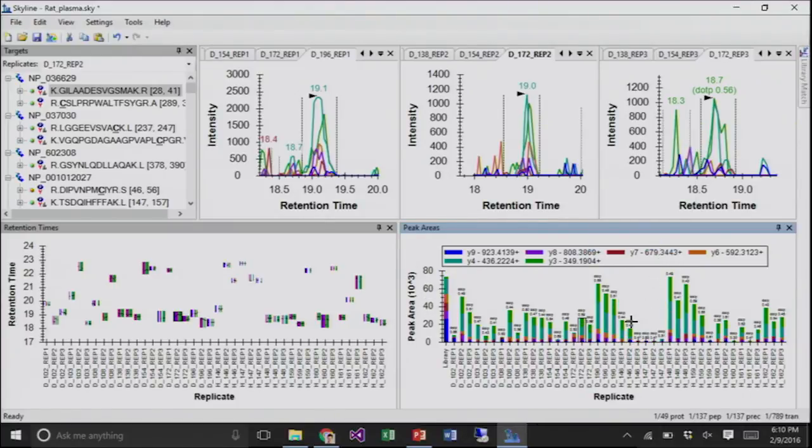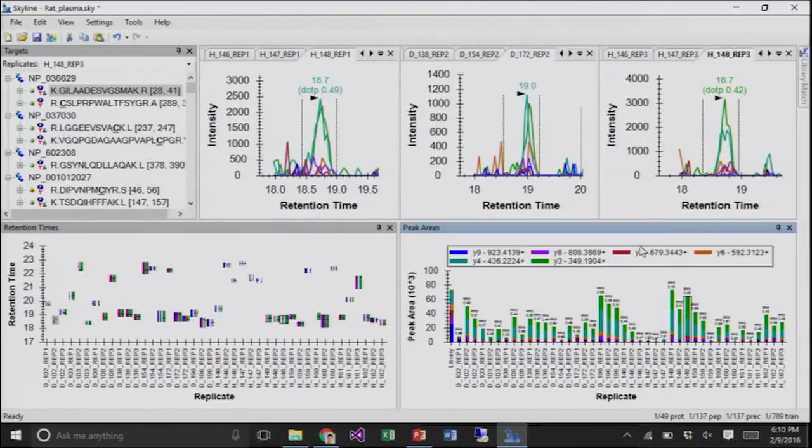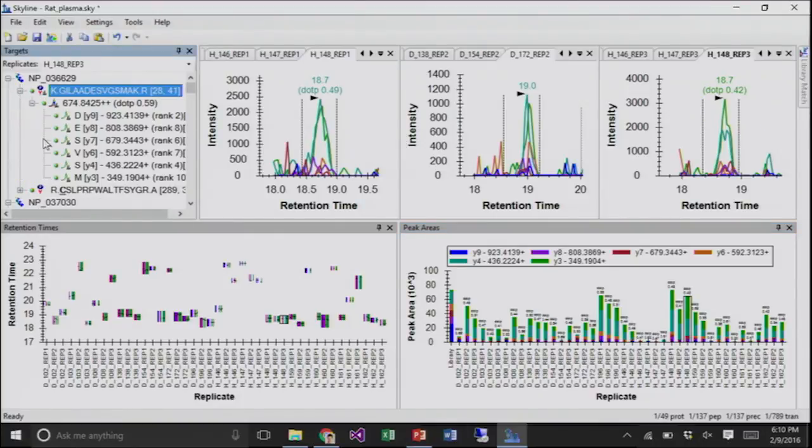And so now we can see, so frequently when you have some questions about a certain peptide, it may be most interesting to see, well, what does it look like when it's the most intense? So we can click on some examples of high intensity. And wow, how many are we supposed to be seeing? Do we see 6? Does anybody see 6 co-eluting transitions? No. At best we see 2, right? And what are those 2?